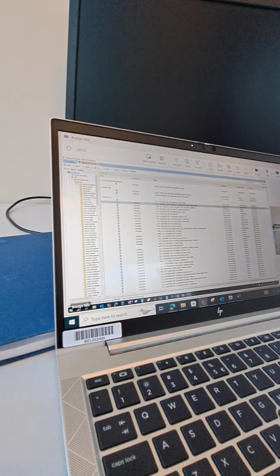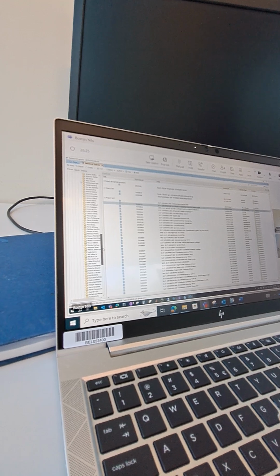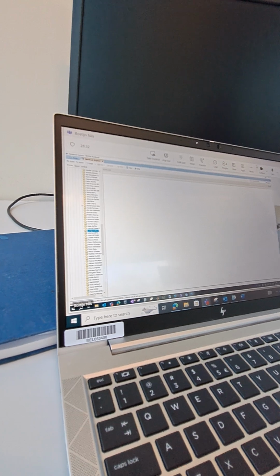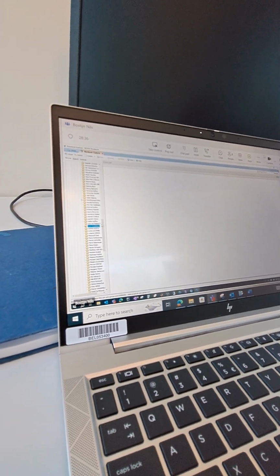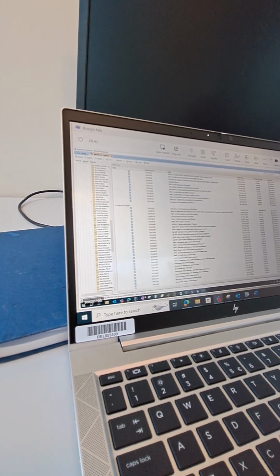If you expand the list, you will see all the persons who work in the analytical plus people in solid state. For example, if we take Lore, you can click on her name. Here she has two names. If you click on her name, you will see all her ELNs.